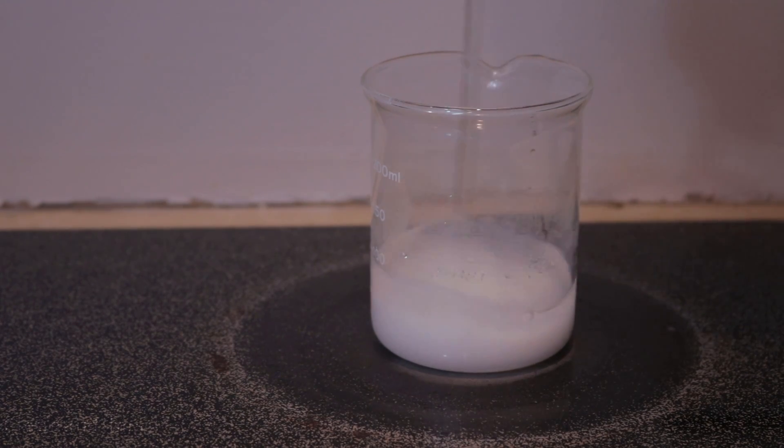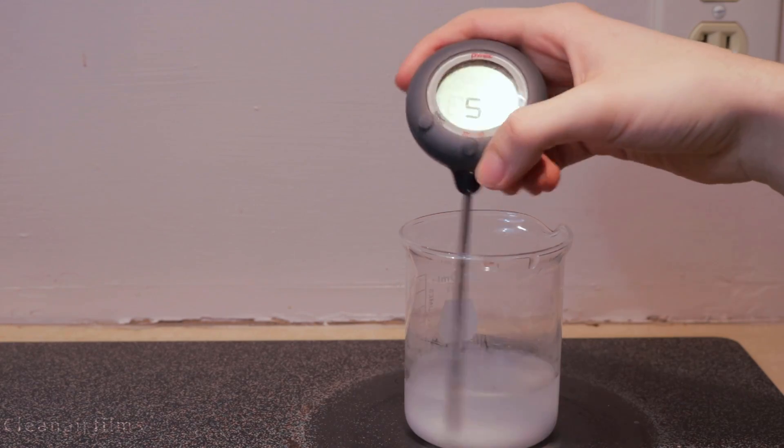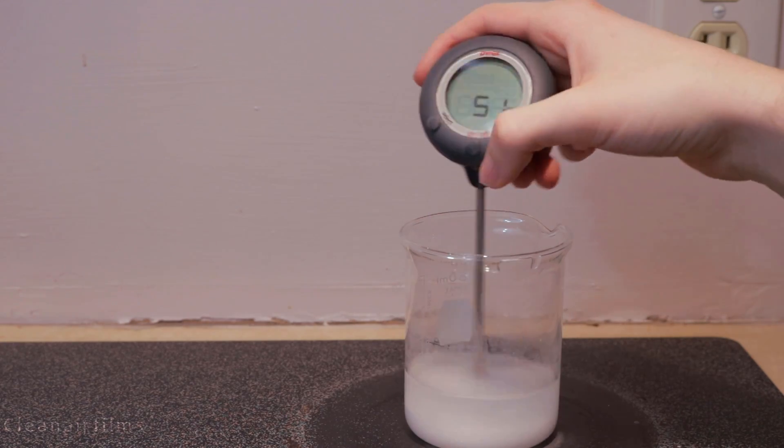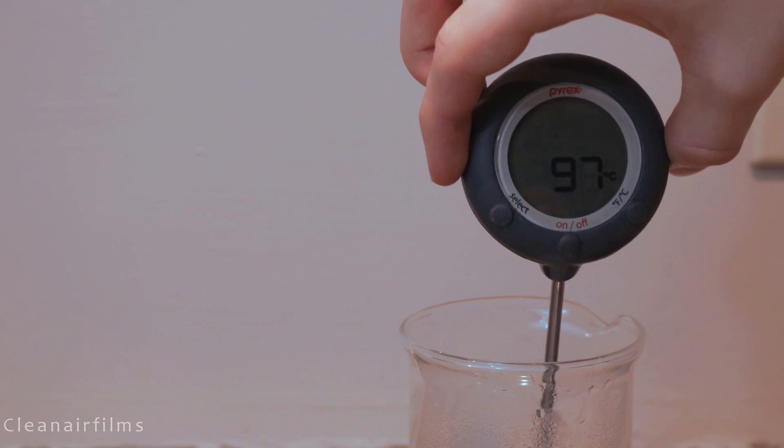Stir the salt and water and turn on the heat. Use a thermometer to stir the solution and monitor the temperature. Heat the water to 95 degrees Celsius stirring continuously.